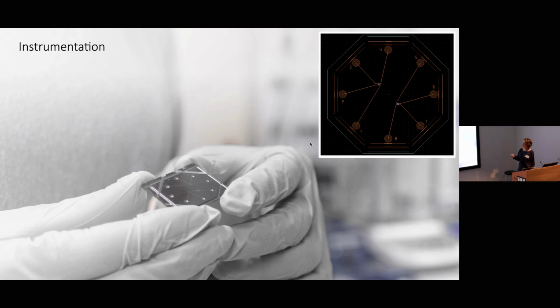And this is how the chip looks in reality. It's a centimeter-square chip that is produced by a series of different nanofabrication and microfabrication methods. The nanochannels are inscribed by electron beam lithography. The microchannels are produced by optical lithography. And then at the end, the fluidics is enclosed by a glass lid using fusion bonding.